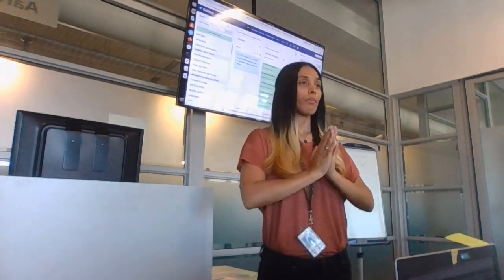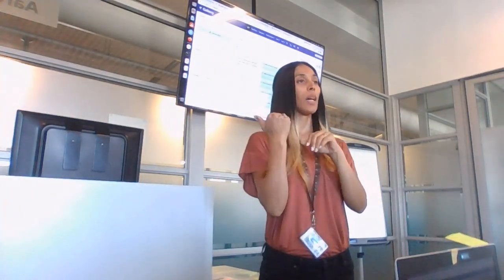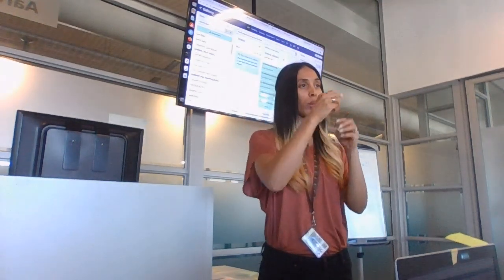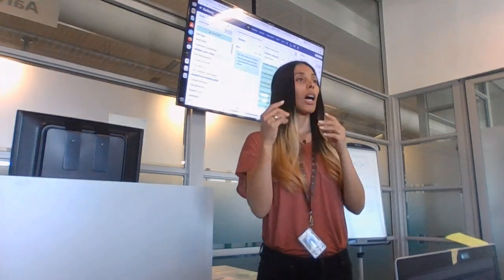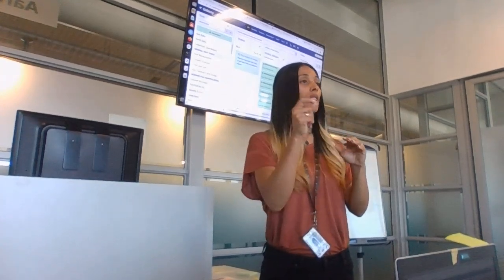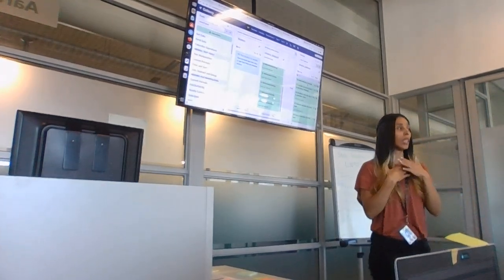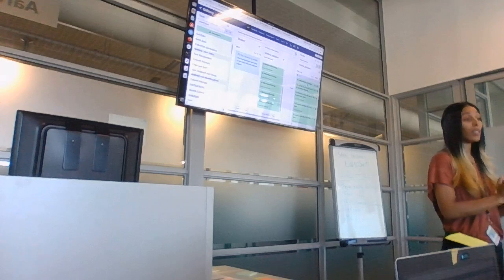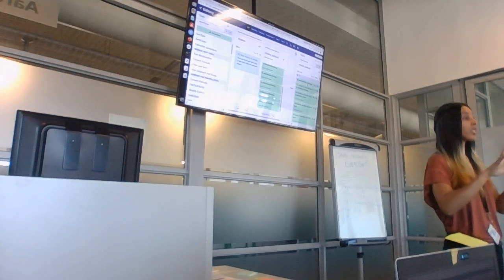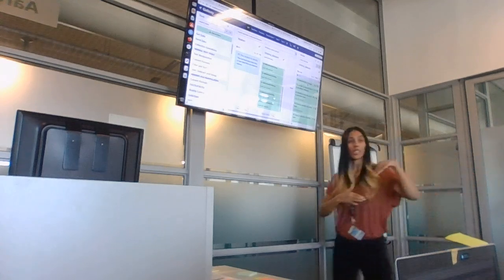No, okay, so I want to copy this problem file to the Kraken thing. But when you're in the switch histories, it doesn't seem to want to allow me to drag it across because it's paired as one data set. So I'm just showing what you would do normally if you have individual files. This is a good point because as soon as I upload files, let's say 10 files, before I make it into a collection, I copy that history so that I have the files single for whenever I need to use it in single format. Does that make sense to everybody?